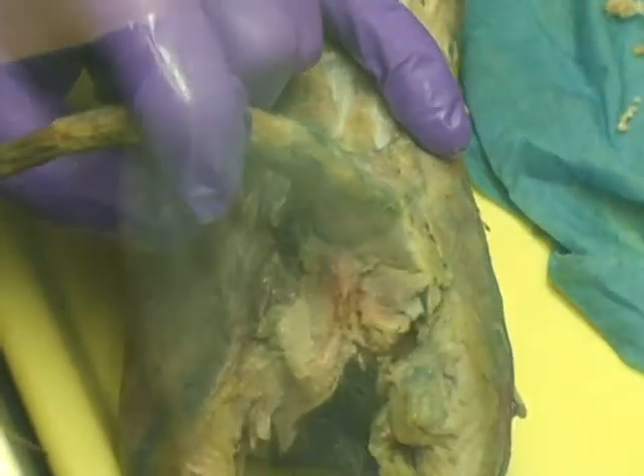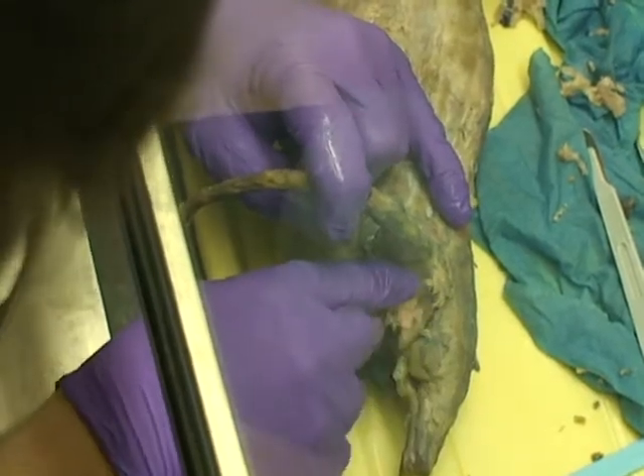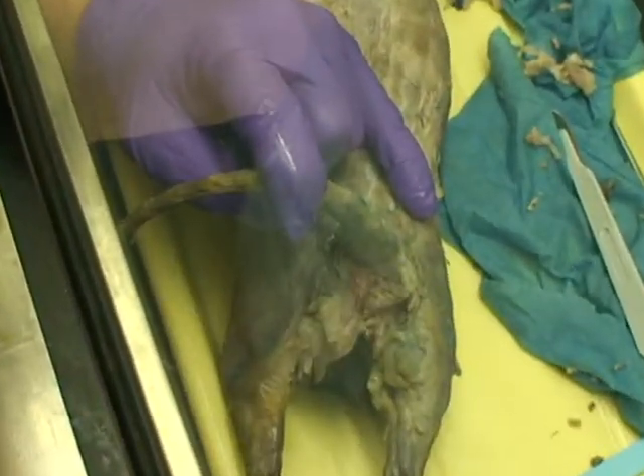If you're wondering if something's the anal gland, just think about the tissue type. It looks very similar to the mandibular gland. It's a little darker color, and it's generally buried in the fat.